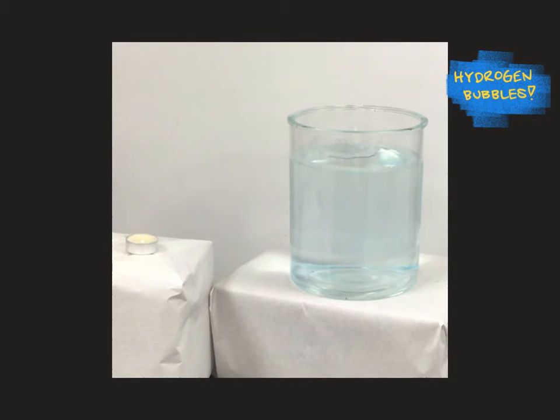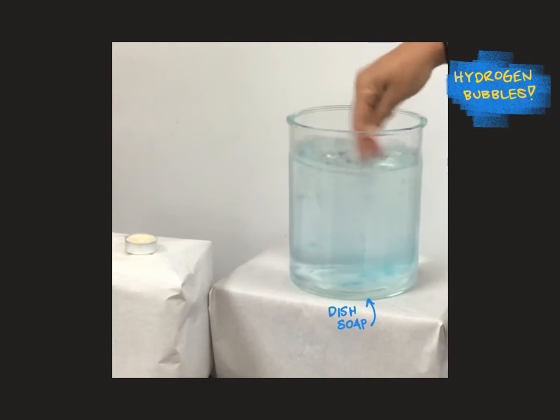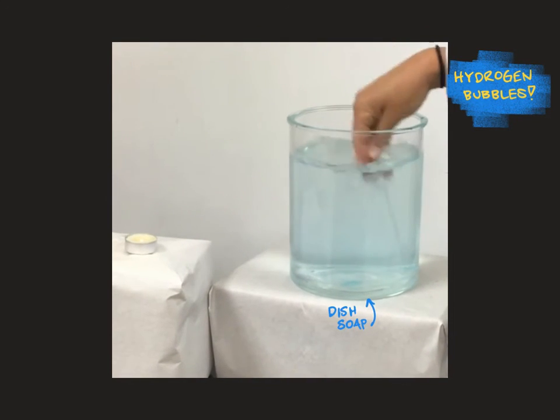So we're going to react the zinc metal that we saw in the previous part of the video with hydrochloric acid, producing hydrogen gas. And that hydrogen gas is going to get bubbled through a solution of soapy water. Right here you see that we're adding some Dawn dish soap to our water, and we're going to mix it up, getting the water nice and sudsy.